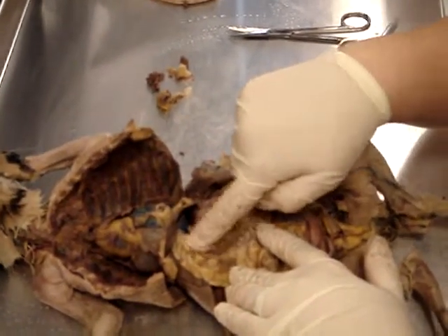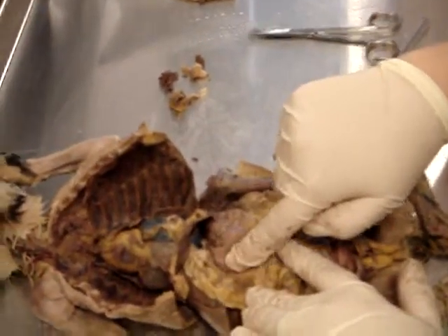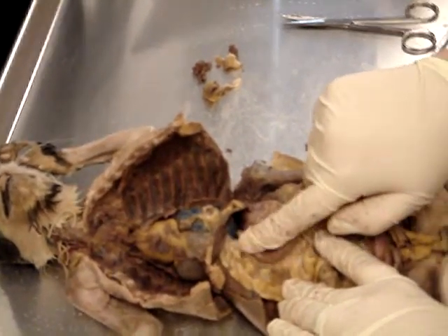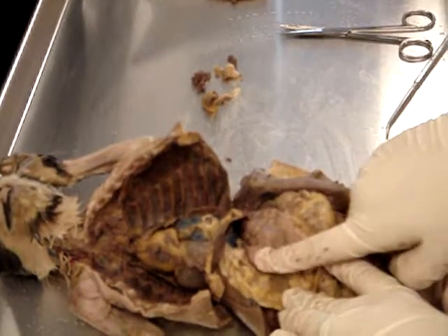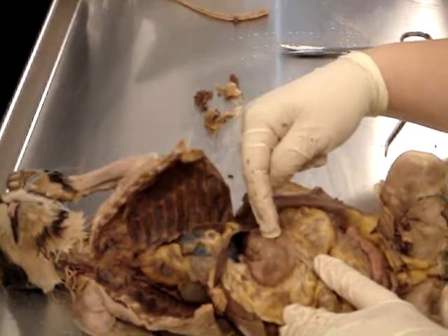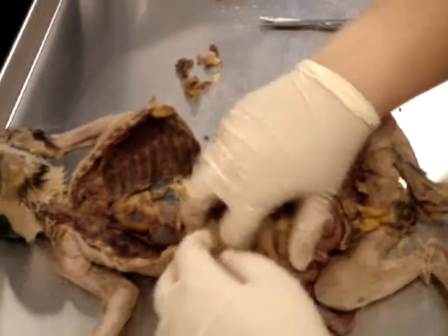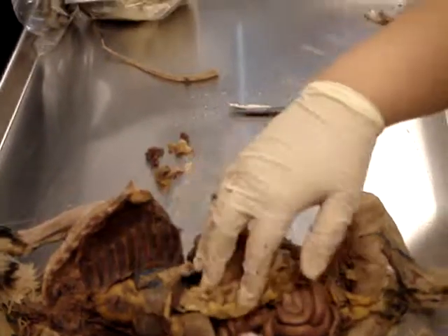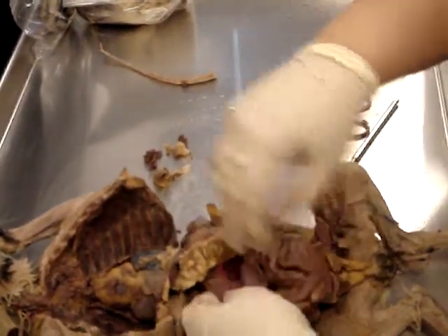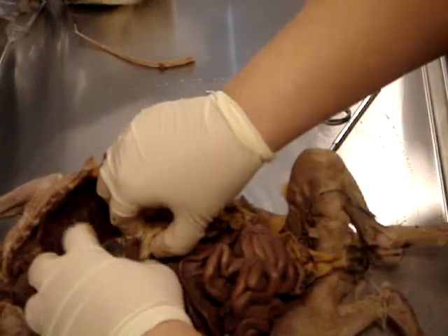Okay. Then we have the last little piece, which is like the tip of a J, and that's called the pylorus. So the last little tail of it is the pylorus. It's right there. Okay. So fundus is the curvature on the top, cardiac region, body, pylorus. Okay. Now, what's a sphincter again? Somebody remind me what a sphincter is? A muscle that's oval shaped or something. A circular muscle. Okay.